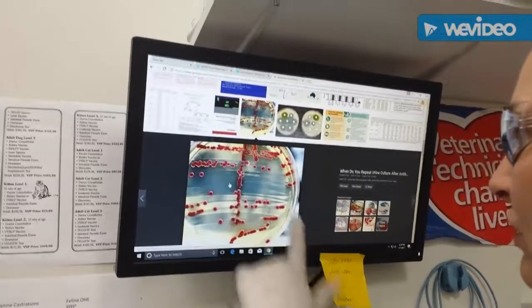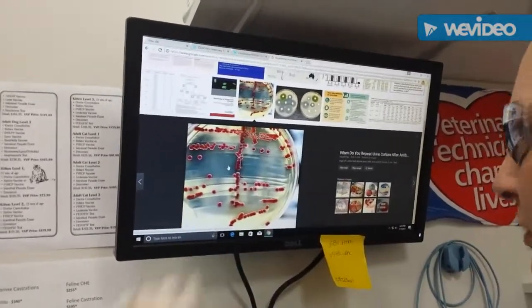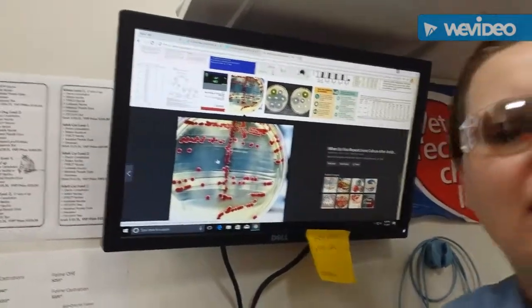As you can see here, here's another disc with a bunch of different growths on it. I don't see any bacterial discs in there. So that is now the end of task 18.